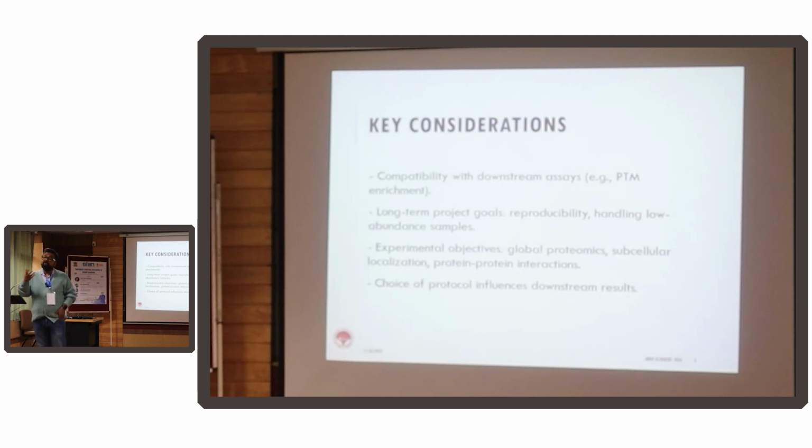So if you are going for a low abundance protein, that's one case. But sometimes you are working with highly abundant proteins, like plasma samples. You want to check the difference in expression of a certain set of proteins. Most mass specs will get overwhelmed because they are getting some very strong signal, maybe from the immunoglobulin part, from the globins, from the albumin that is there in our blood. So how do we remove that? Any instrument, even us, we have a way of separating out.